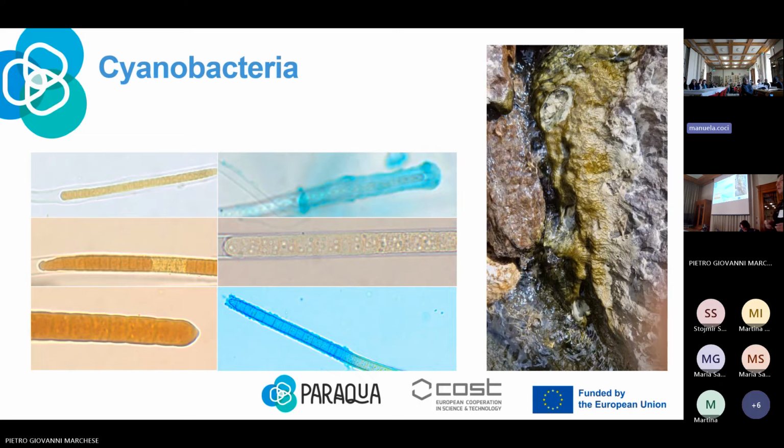Production of exopolysaccharides can make the isolation process and our desire to get a pure axenic culture very difficult, because the exopolysaccharides have gluing properties, so bacteria can easily be bound in the exopolysaccharide, and during the isolation process, they can be transferred together with our target specimen to the culture vessel.